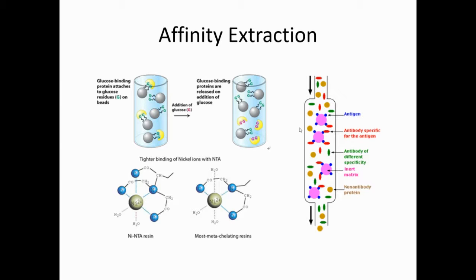And the magnetic particulate materials basically are beads, all right? The beads are preferable as support in this isolation process because they have a larger binding capacity. The nucleic acid binding process can be assisted by the nucleic acid wrapping around the support.